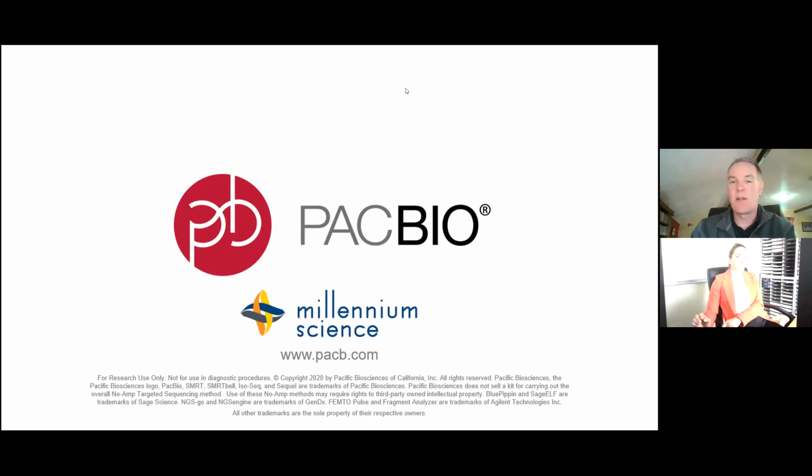And in 2 weeks' time, we'll give another one which focuses really on whole genome sequencing of plant and animal genomes, so large complex genomes, and using HiFi, long read, high accuracy, single molecule reads on PacBio for making those assemblies from complex whole genomes.